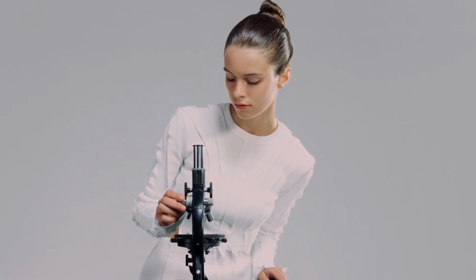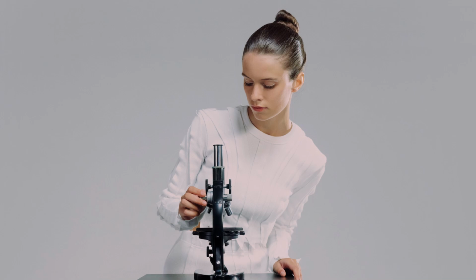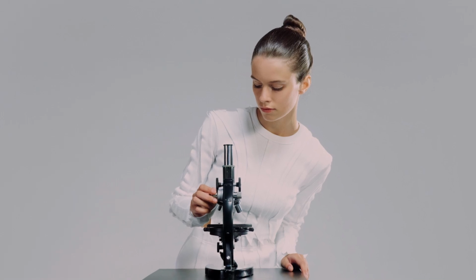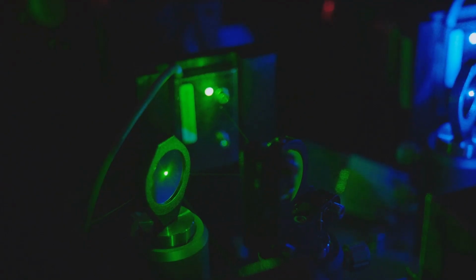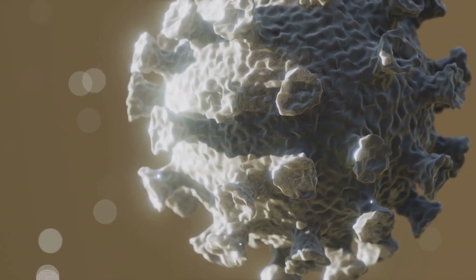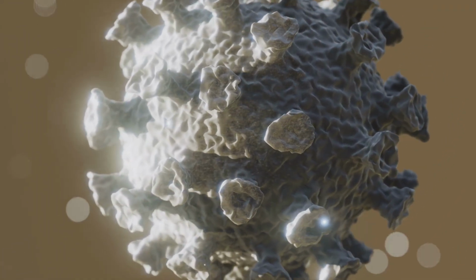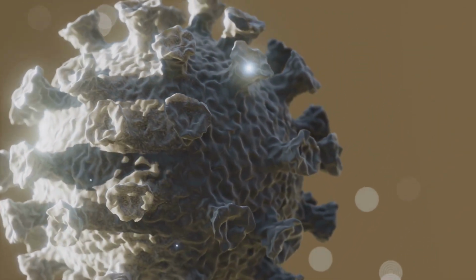Far from it. Scientists and engineers are constantly inventing new ways to see smaller, faster, more clearly. One of the most exciting areas of advancement has been in light microscopy. For a long time, everyone accepted the 200 nanometer resolution limit as an unbreakable rule. But in recent years, several clever techniques, collectively known as super-resolution microscopy, have smashed right through that barrier.